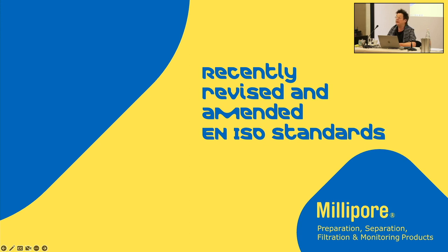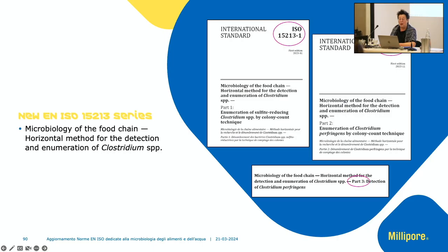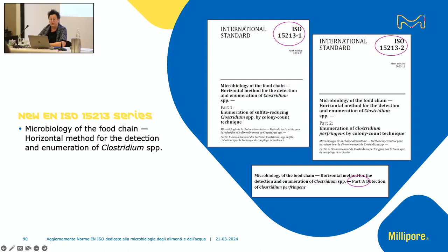Coming now to recently revised or amended standards. A very big topic recently published is the new EN ISO 15213 series for Clostridia and Clostridium perfringens.